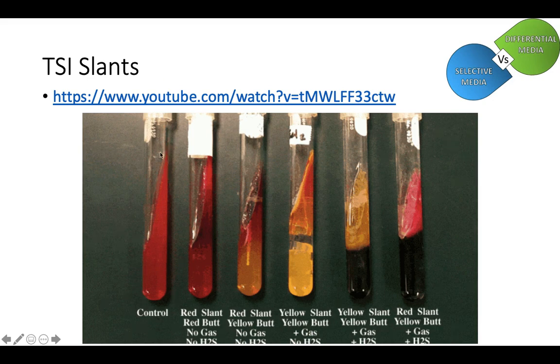So you're going to introduce some bacteria. You're going to stab them down inside of here all the way to the bottom of the little glass tube. And you're going to pull it up and you're going to streak the top. So you're going to put it in the incubator and you're going to come back 24 hours later, 18 to 24 hours, and see what happens.